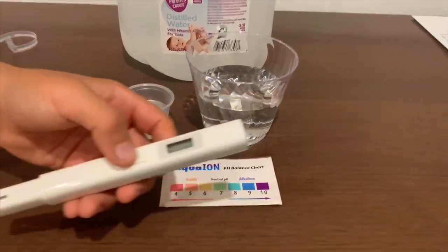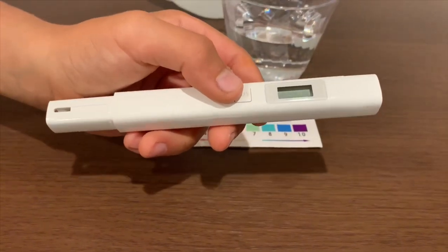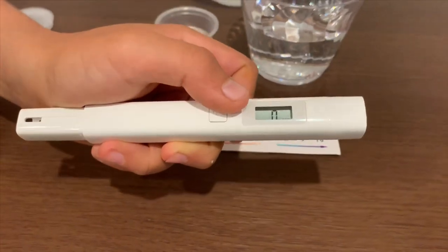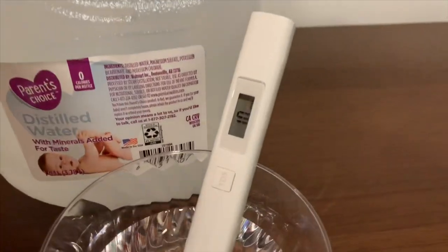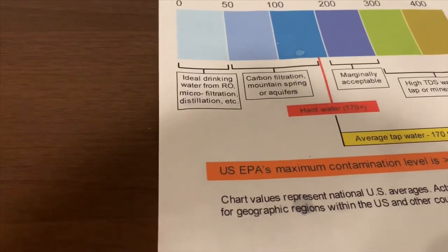First, we're going to test the TDS levels. If you want to buy this TDS tester, check the link down below. Turn on the TDS tester, make sure it says zero, and put it in. The reading is 10 — that is microfiltration water.